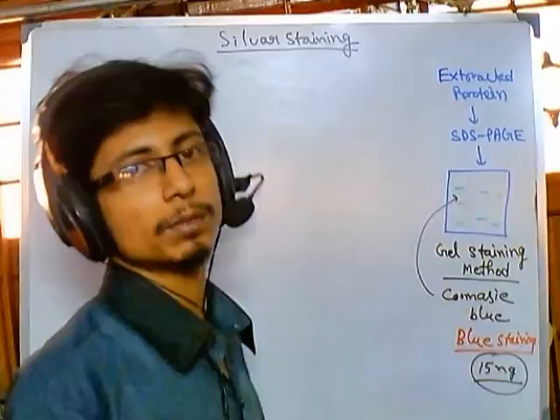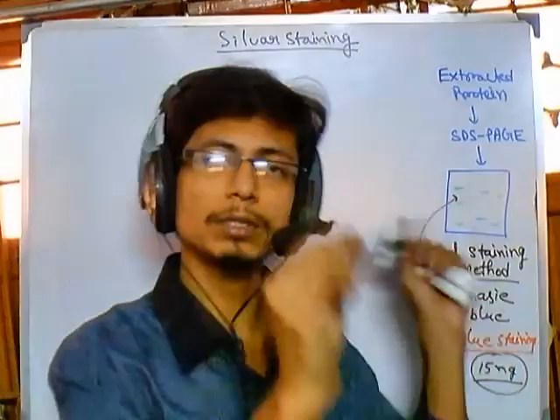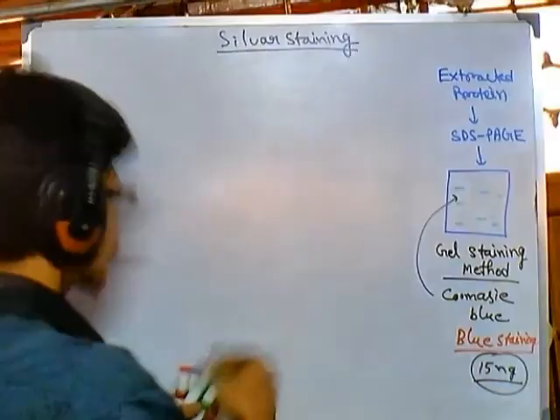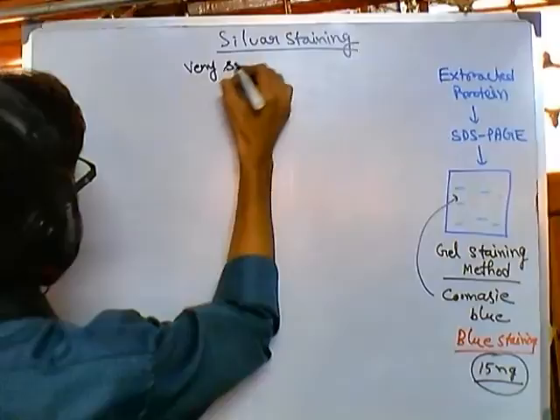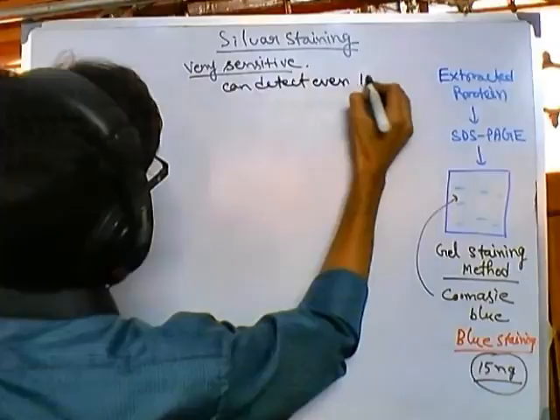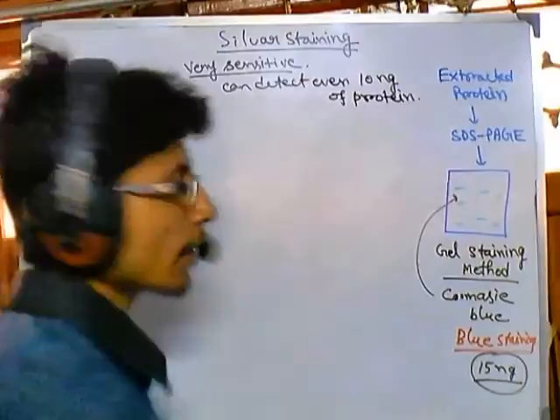Sometimes we get bands which are very faint. That means the concentration of the protein in the mixture is very low, right? To visualize those faint bands, those small amounts of protein, we need to rely on another technique called silver staining. The advantage of silver staining is that it is very sensitive. It can detect even 10 nanogram of protein, at least up to 10 nanogram of protein.